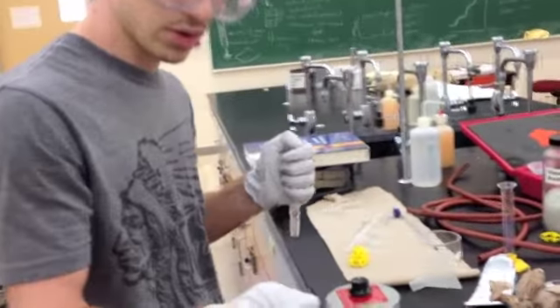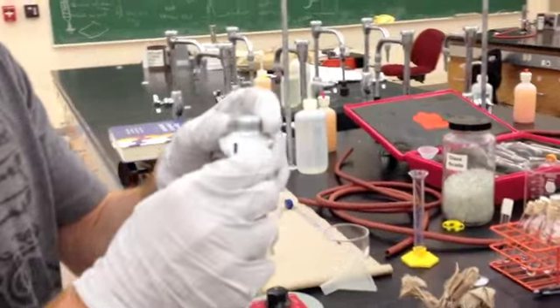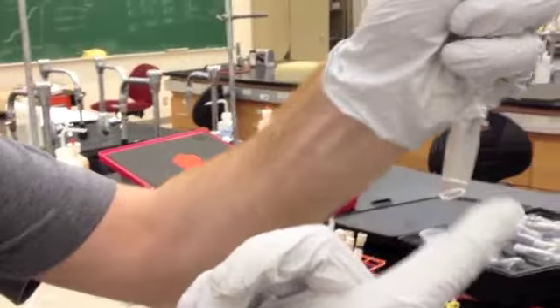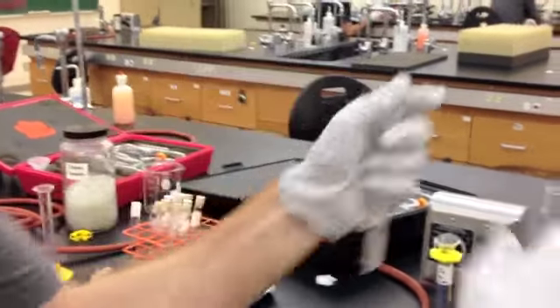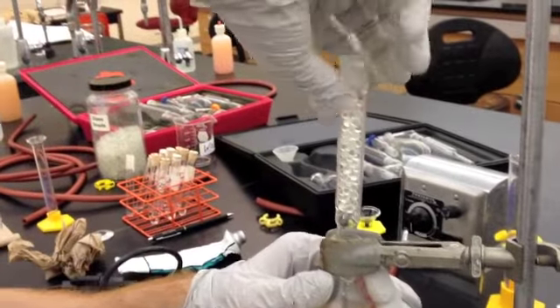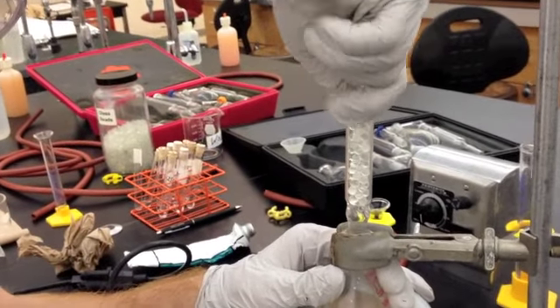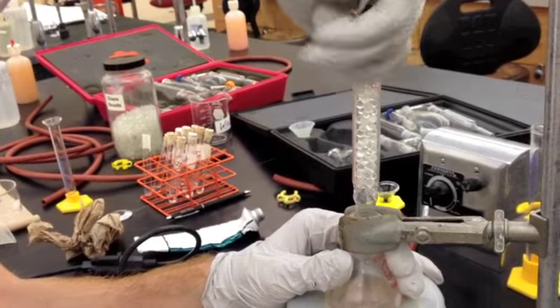Now, before adding it to the round bottom flask, you want to grease your joints a little bit. Take a little bit of grease, put it on the joint, and then with the round bottom flask, just circle it around until you get a seal, and you'll see the difference.